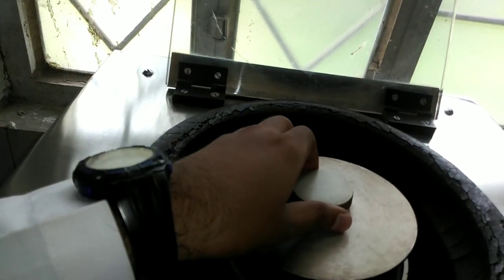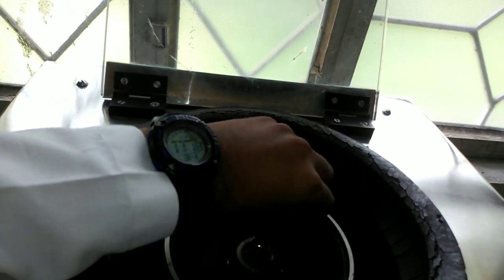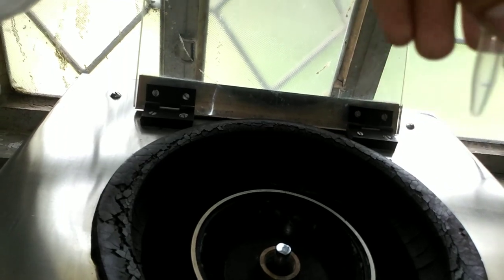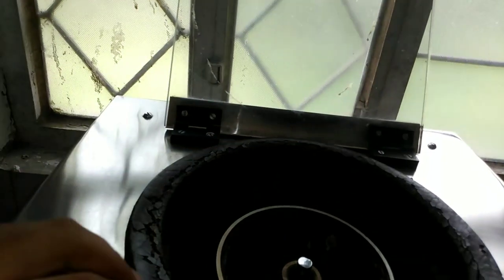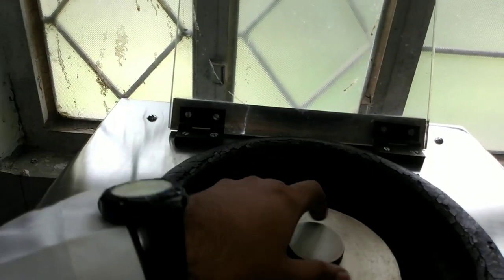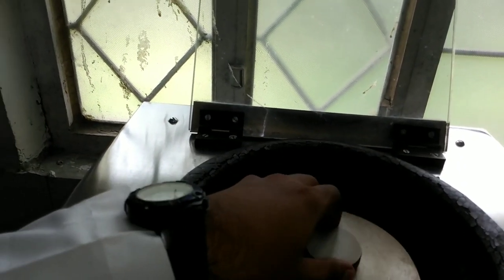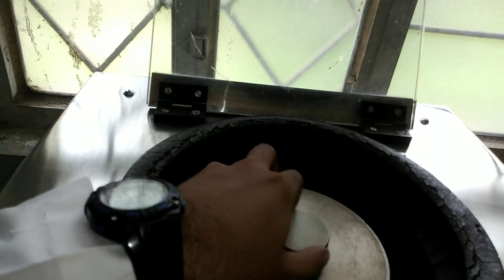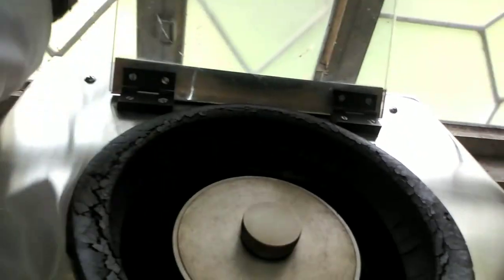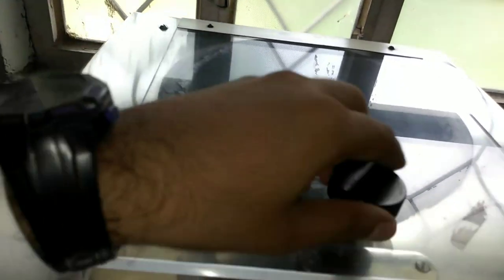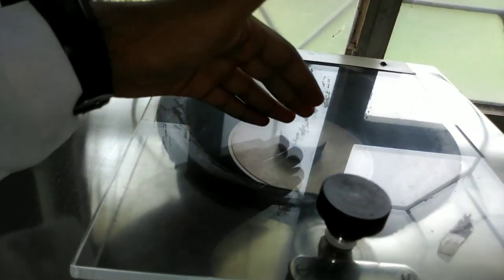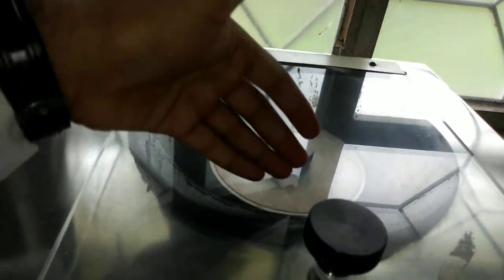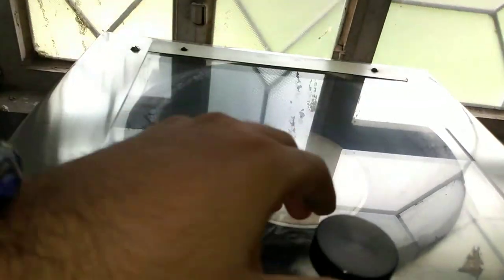After putting the Eppendorf tubes inside — as you can see, this one is filled with liquid sample — make it tight so it doesn't come open while rotating. Then there is a safety glass cover so that if a tube is loose, it will not fly up and hurt you.